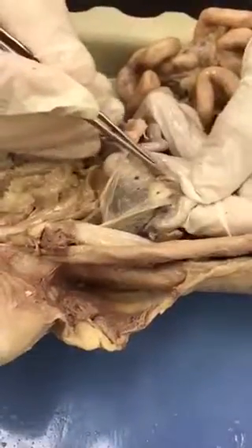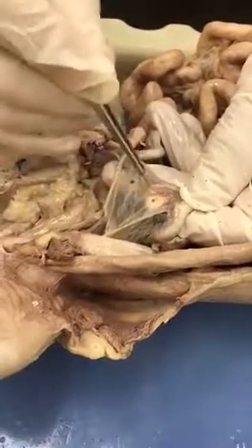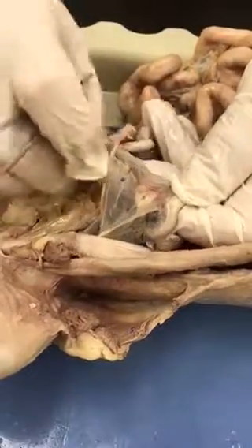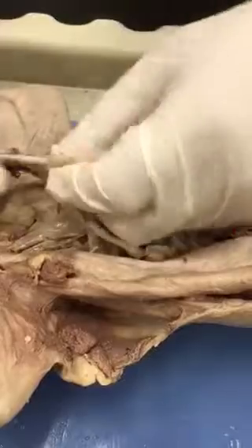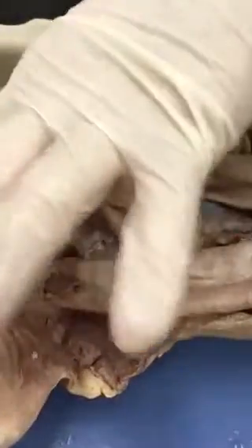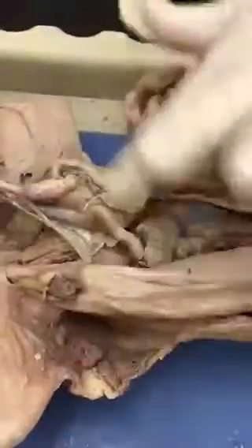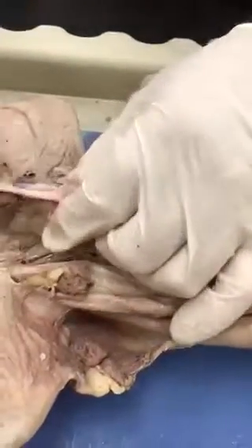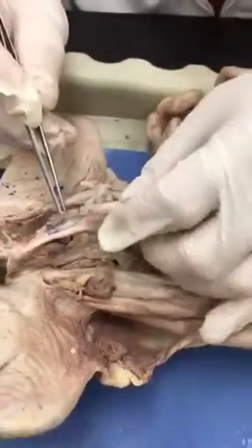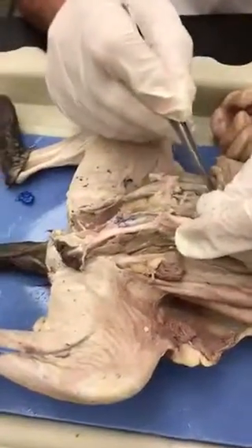It runs along the horn. Now you don't really see the artery, but it's there. I can see some blue color, so you know that's the vein. And of course, there's another one on the other side. So there are two uterine arteries, one on each side of the uterus, and each one of those follows one of the uterine horns. See on this side? See the uterine artery right there, and a vein, and it continues along the horn.